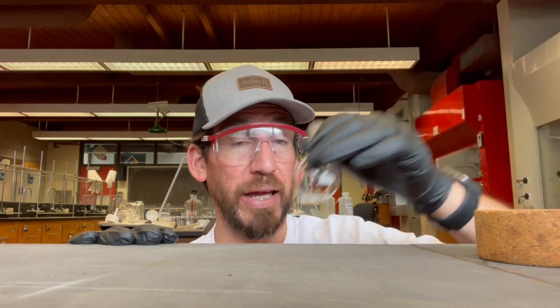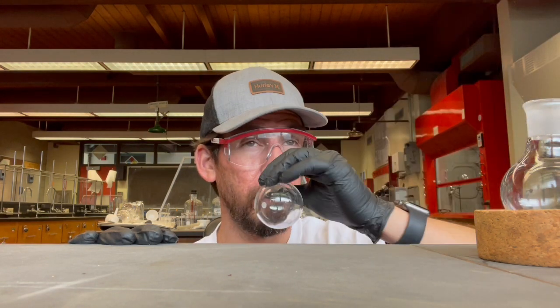If you don't know, 200 proof is 100% ethanol. So if you have 100 proof, that means you have 50% ethanol, and 80 proof, which is a typical vodka, is 40% alcohol, right? I'm telling you, you're not in here, but ugh, smells like vodka for sure. And yeah, no, that's nasty.